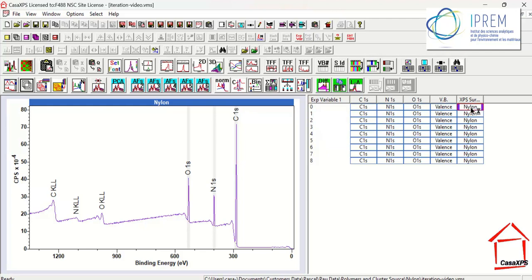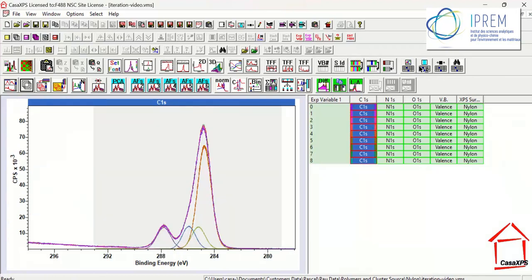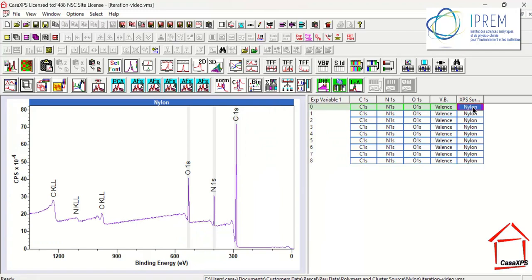So we only really have the carbon and this one survey measurement at this point where there's some sort of processing in terms of peak models, regions, and we can see which ones have the peak models if we use this button here that says select blocks with components, and there it is. We can see that we've got the Carbon 1s. Now we can select the blocks with regions, and this will include the survey measurement because this had regions defined. You can see these three regions, and that's the reason that that was highlighted at the same time as the Carbon 1s. Carbon 1s had regions because of the peak model, so these are the only VAMAS blocks with either regions or, in this case, components.